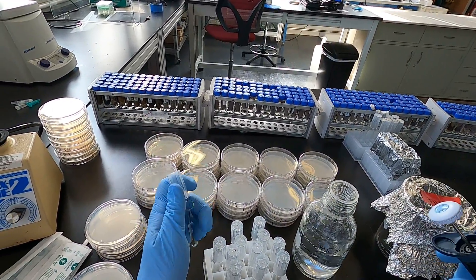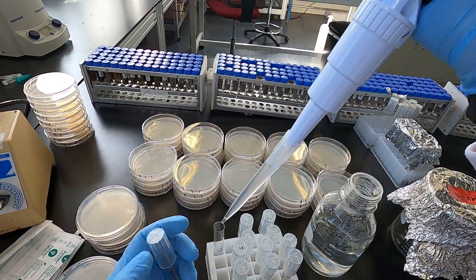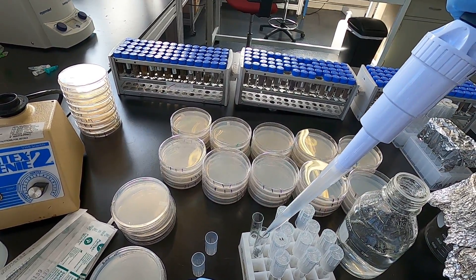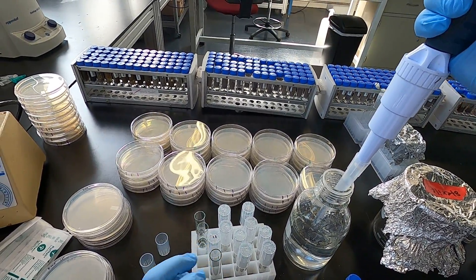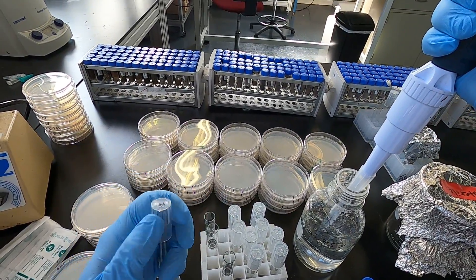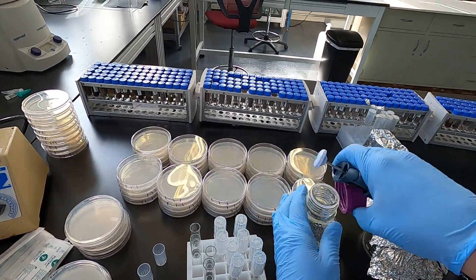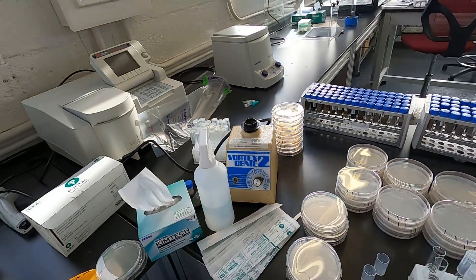We're going to do one-to-ten dilutions. The 0.85% sodium chloride is around isotonic for most cells. If things are too salty or not salty enough, you can change the osmotic pressure in some of the samples, and that can lead to cell death. If you're looking for spore formers, then it's not that big of a deal.